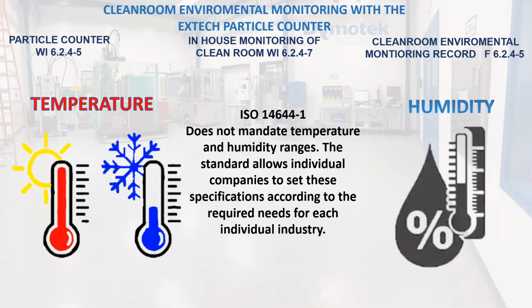Unlike the particle count, temperature and humidity, though needs to be monitored, does not have specific ranges that it must meet in order to qualify to be part of the ISO 14644-1. It does not mandate temperature and humidity ranges. The standard allows the individual companies to set these specifications according to the required needs for each individual industry.